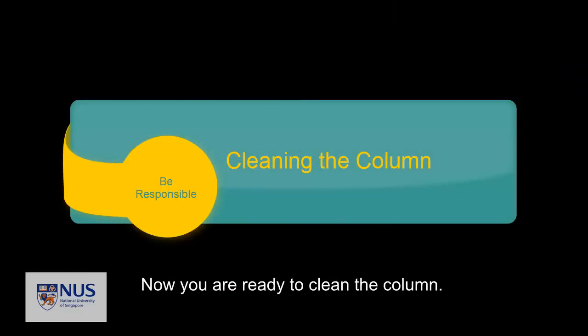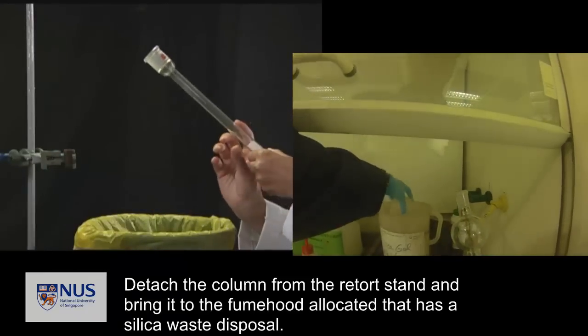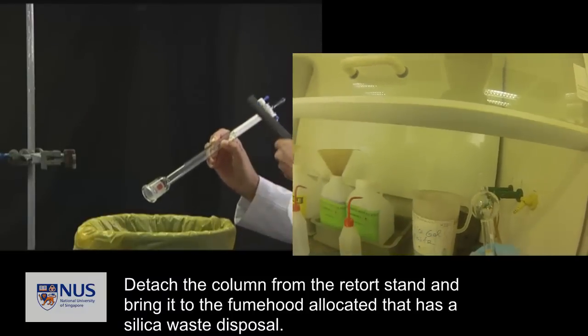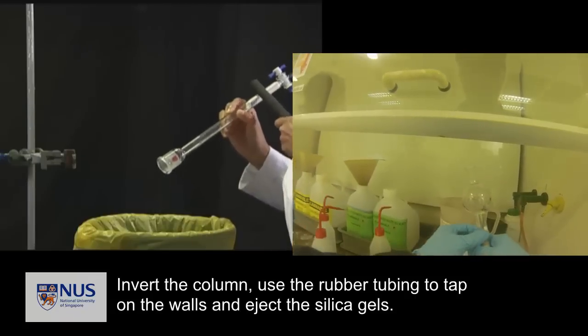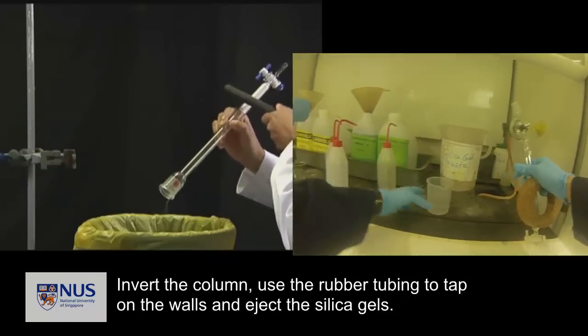Now, you are ready to clean the column. Detach the column from the retort stand and bring it to the fume hood allocated that has a silica waste disposal.